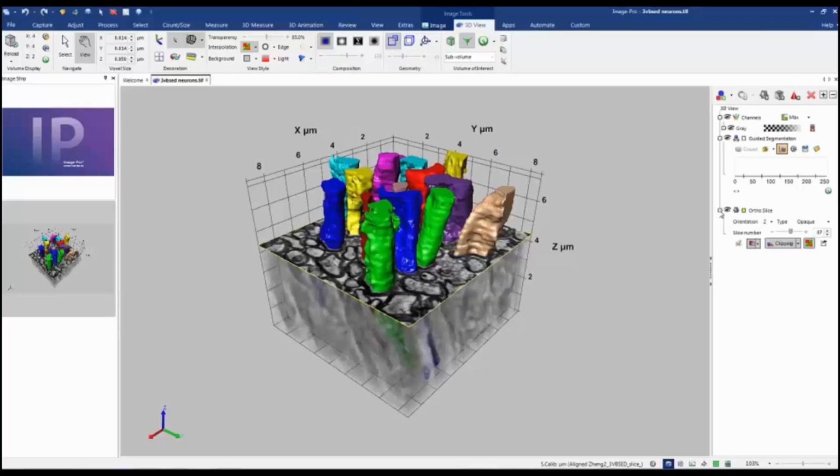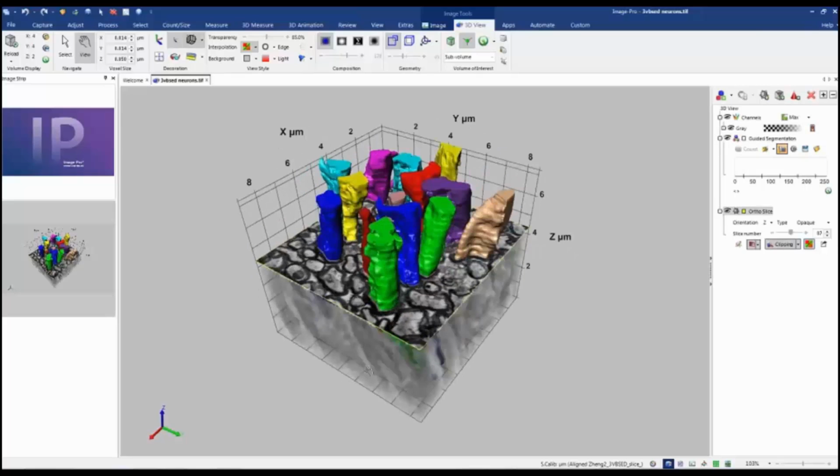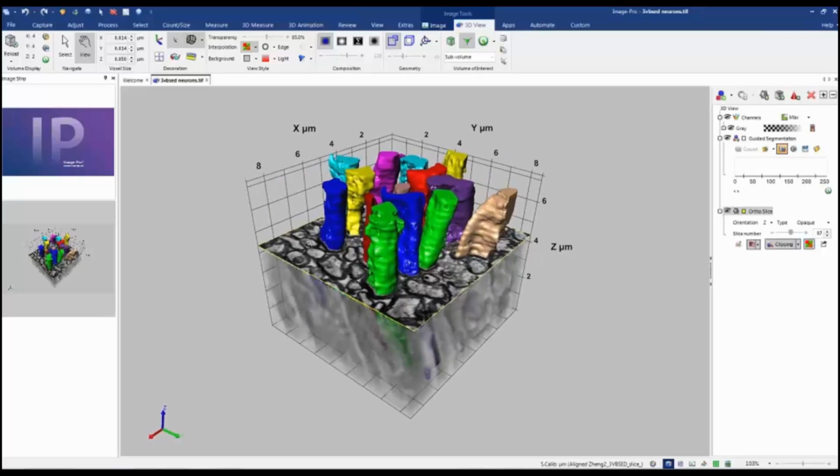Before creating animation, you should think what do you want to show, and if you want to show slices, you have to create slices beforehand, and if you want to show isosurfaces, you should create isosurface beforehand, and then place the elements in the right order, and think about all the steps for animation.